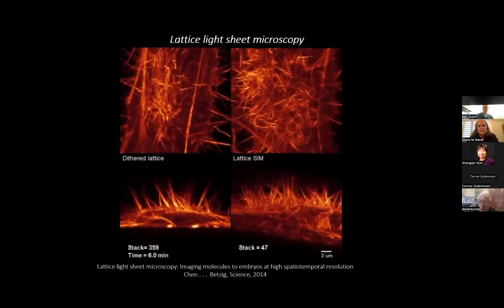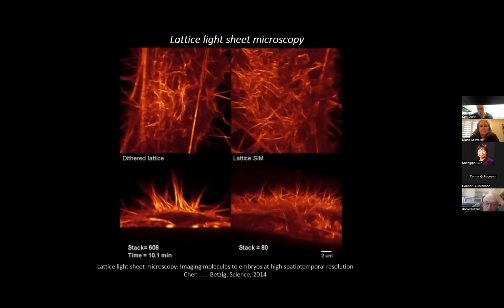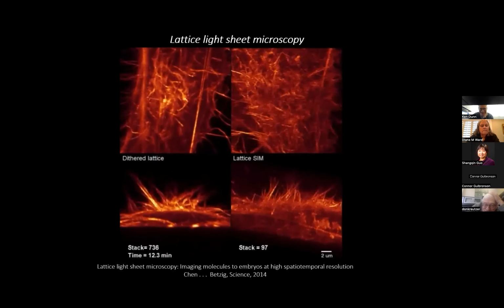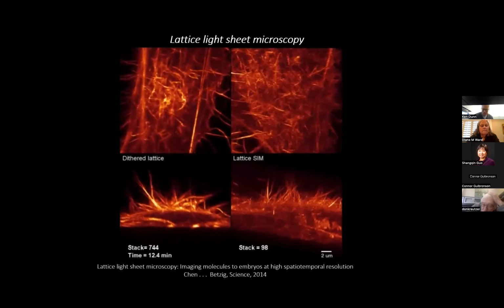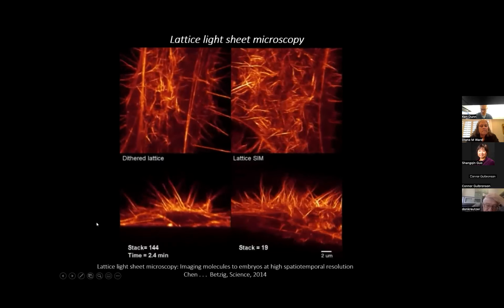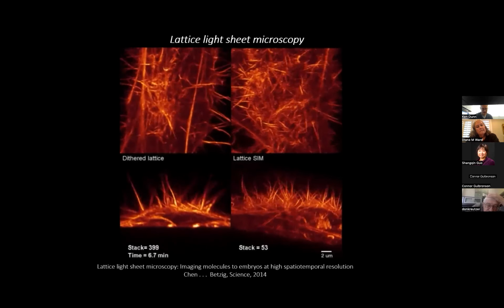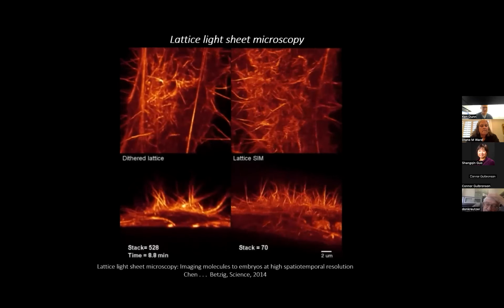I'm learning about this. Okay, sorry. I see these things waving in the breeze, but in the real world, what are we actually seeing here? I'm not in a position to say what these are because I'm not an actin biologist, but this is fluorescent actin. So it's inside the cell. This is inside a cell. These are living cells waving projections around. And is there anybody on the call that can talk to us about what these waving projections are, then we can get at that. But again, this is not something you would be able to detect in any way.